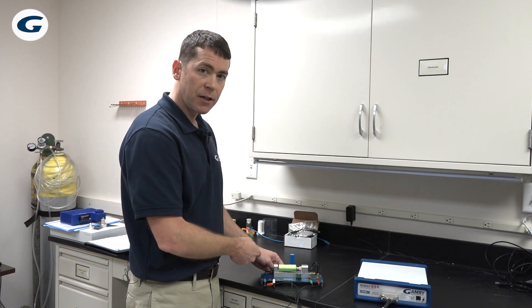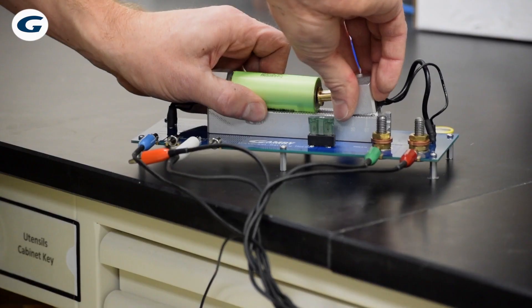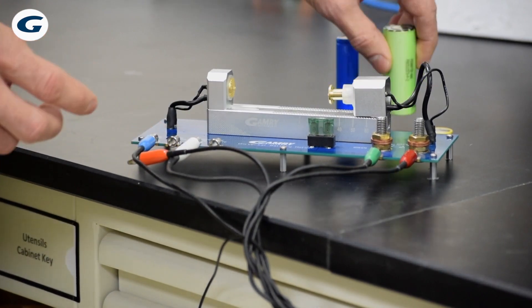Then it's really easy to take the cell back out. You simply tilt this, move it backwards and you can remove your cell.